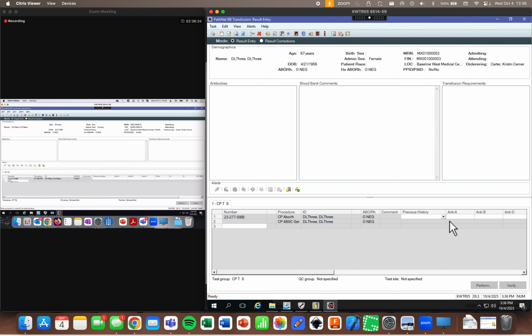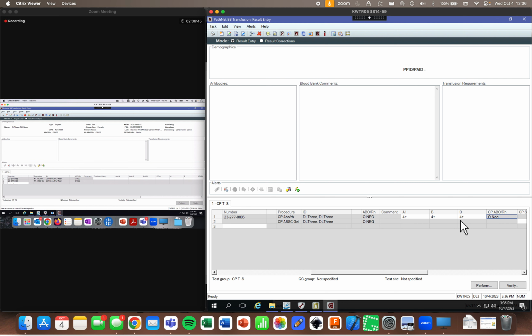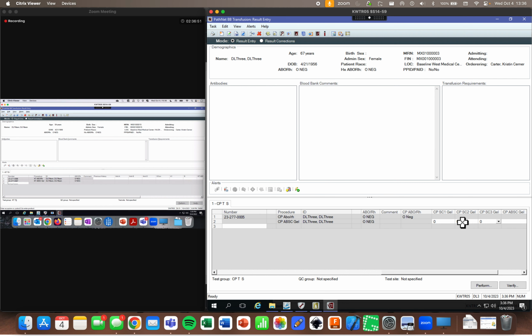But if I do 7, there we go. The filter's still going to work. It's just, I have 2 different accession numbers instead of the same one. Not hearing that we had any issues with that.